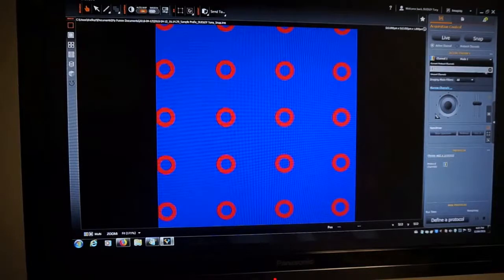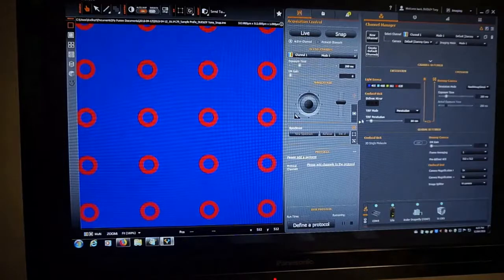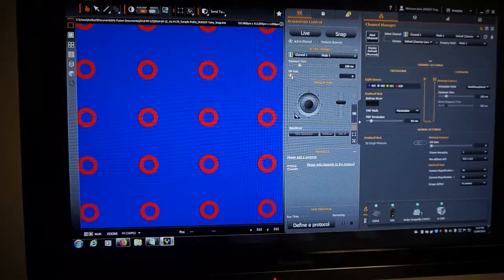So I add this in, it's now a protocol channel. Okay, and you can see that up here. If I don't want it to be a protocol channel, I remove it. Okay, then manage channels does the same thing, it opens up this panel. Okay, and then just below that you've got your exposure and your EM gain.